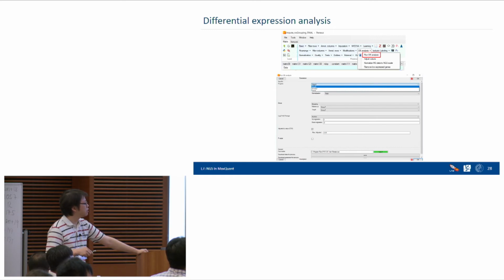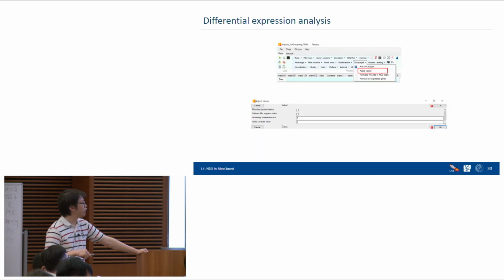And then you can set the cutoff for fold change, log2 fold change. For example, you set 2, that means if the log2 fold change is higher than 2, then we say this gene or this protein is up-regulated. If you set -2, it is the other way, down-regulated. You can set the cutoff of FDR or q-values, like 0.05, to see which genes are differentially expressed. If you only compare two samples, maybe you also can set p-value as a cutoff.